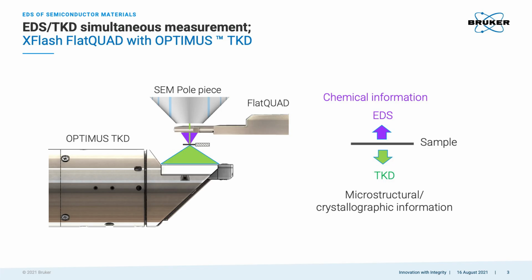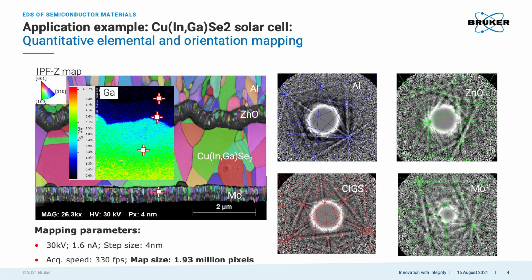And for that, different detectors are available. It depends a little bit. In bulk, the background is higher, and one cannot check at higher energies. In TEM, we can check up to 80 keV. If you really have a strong overlap at lower energy, we can go up to 80 keV and check which element is really there. In SEM, it's not that simple. And also, if you want to see smaller structures, the acceleration voltage needs to be a little bit lower. But it's amazing what the deconvolution can do, and also how fast one can go if one has the right detector. There are different detectors available, standard side entry detectors or annular detectors.